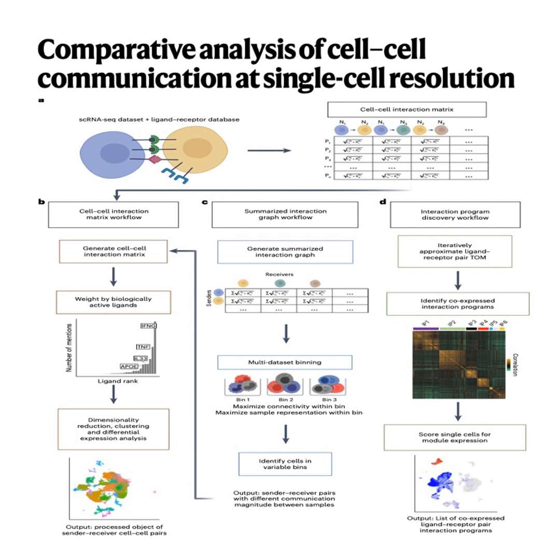Take T-cell exhaustion in squamous cell carcinoma, SCC. This is a really hot area clinically because exhausted T-cells are why immunotherapies often fail. Right. The T-cells just get worn out fighting the tumor. Exactly. But in real tumors, T-cells don't just flip a switch from active to exhausted. It's a continuum. They exist on a spectrum. In the SCC dataset they looked at, the exhausted T-cells didn't form their own neat little cluster on the standard analysis maps. They were kind of smeared across different T-cell groups.